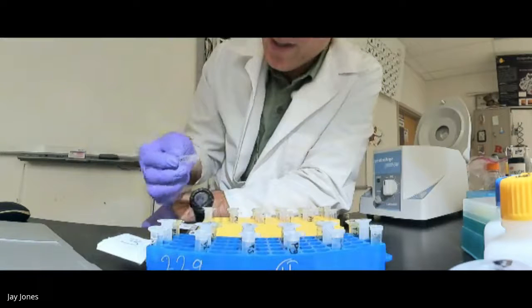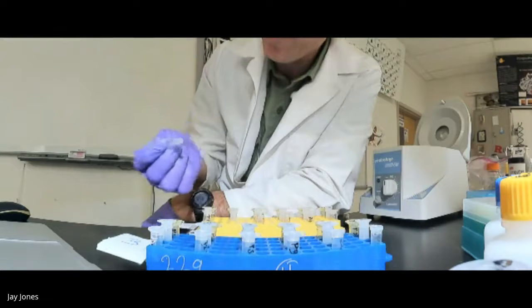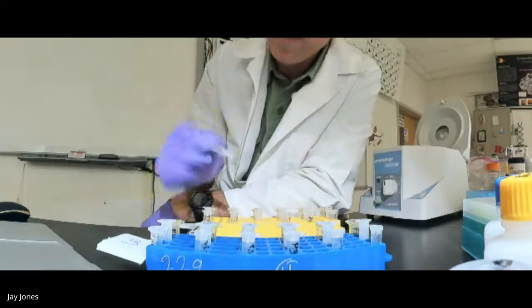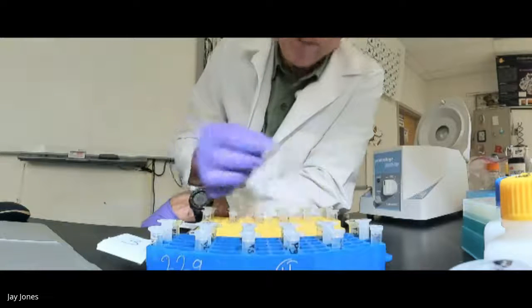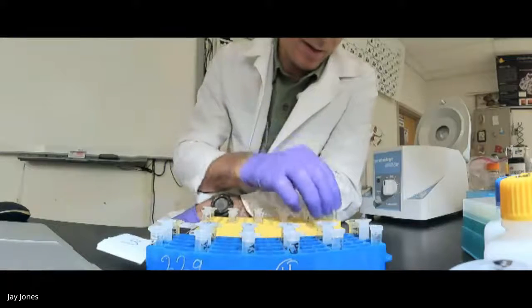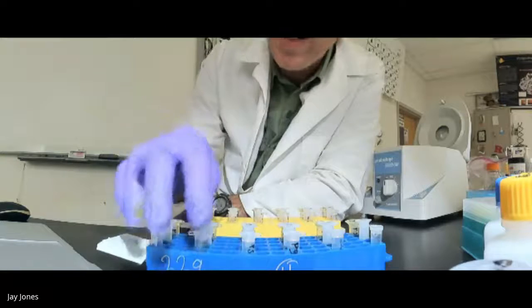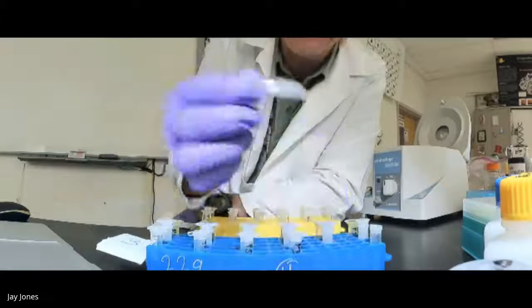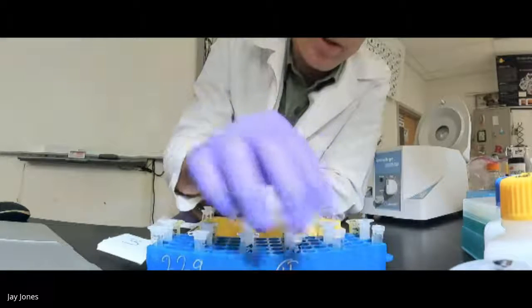So I'm just mixing these to make sure that these soaps work. Soaps have to be very basic. They cannot be H plus rich. They're not protonated. So we need these to be basic, and they are. So solution two is sodium hydroxide and soap. It's actually a soap called sodium dodecyl sulfate, but honestly, it's just a soap. Soap molecules are polar and nonpolar at the same time. They're amphipathic.